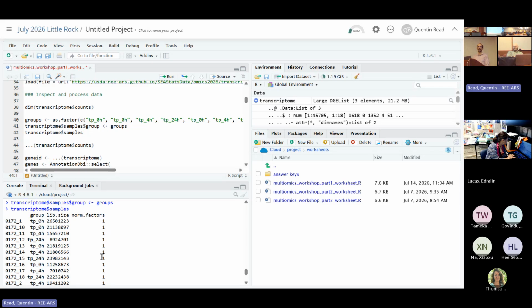And so what would be a minimum that you want? For transcriptomics, I mean, the read counts for these are like 26 million, right? Yep. Is that what it says? That's right. Yeah, generally speaking, you probably want over like 10 million. Okay. 10 to 20 million. So a few of them are borderline, but most of them are pretty good. Yeah. And sometimes this is where you'd say, well, if one of them only had 1 million or something, that sample is useless and should be thrown out if it doesn't exceed the minimum.